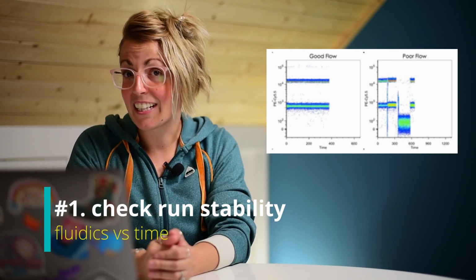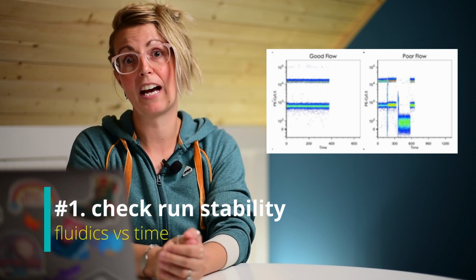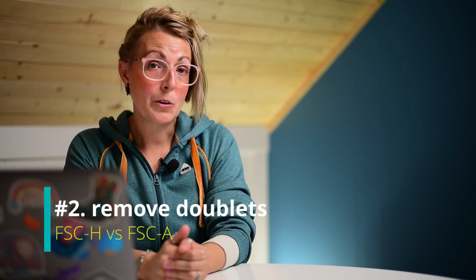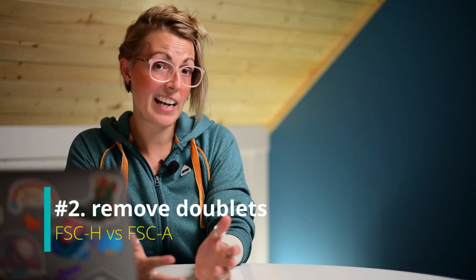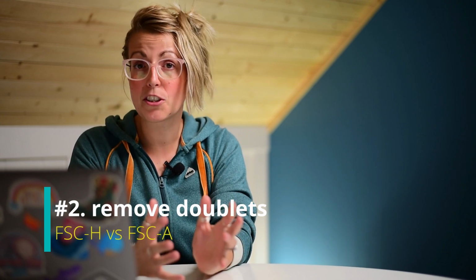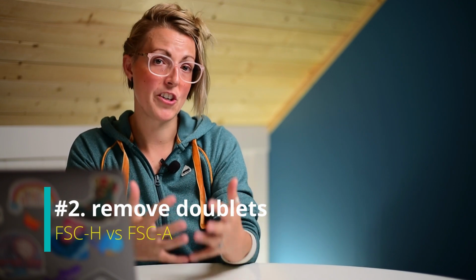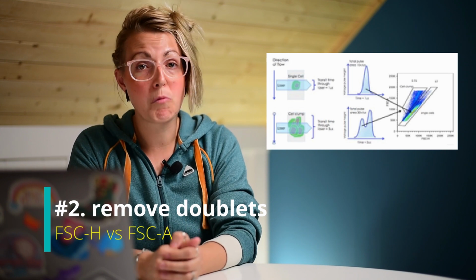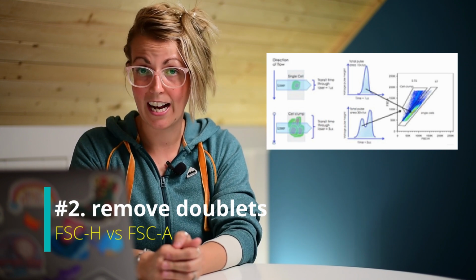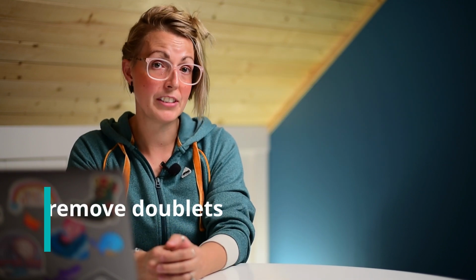I would recommend taking a look at those as they will really simplify this, especially if you have bad fluidics. Tip number 2, remove your doublets. Again, going through a proper gating hierarchy and ensuring that your doublets are removed from your analysis will always result in better data. Again, this can be done simply by using forward scatter area versus forward scatter height and looking for that shift in the population that occurs when you have doublets.